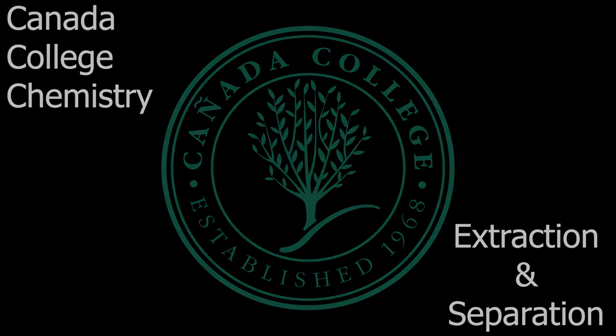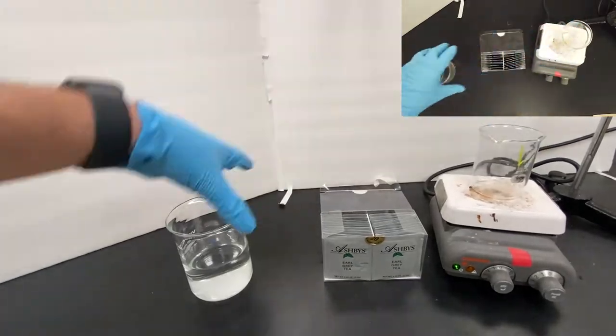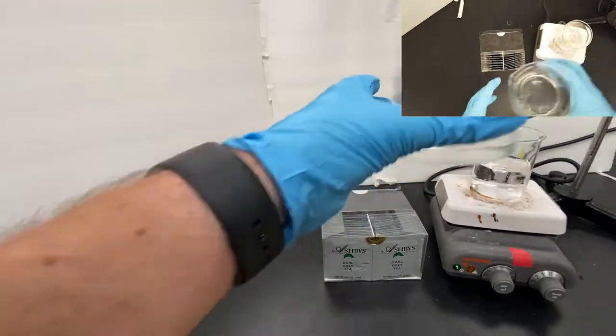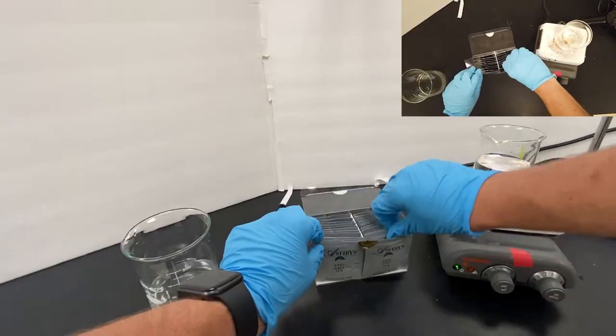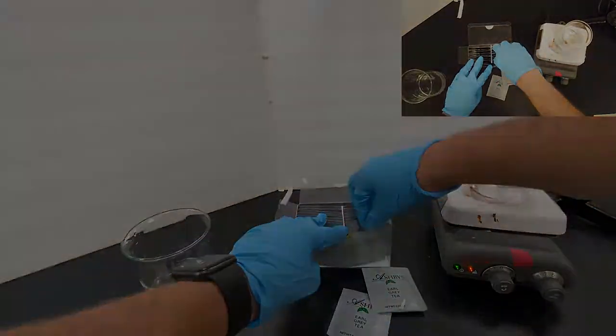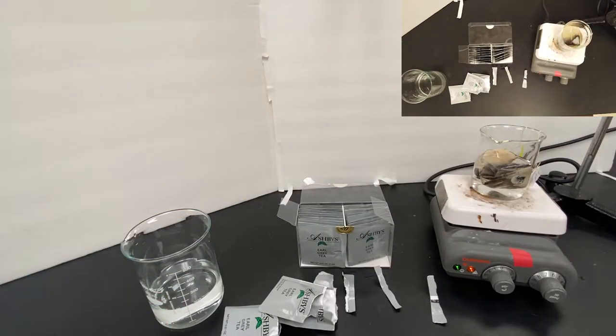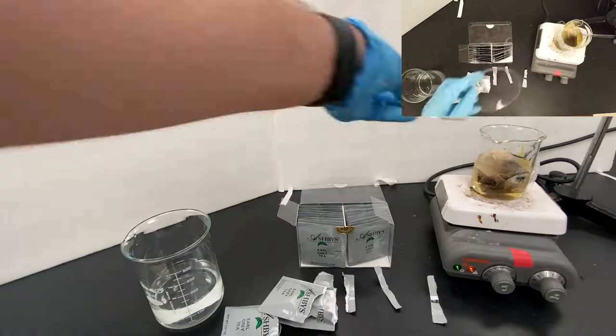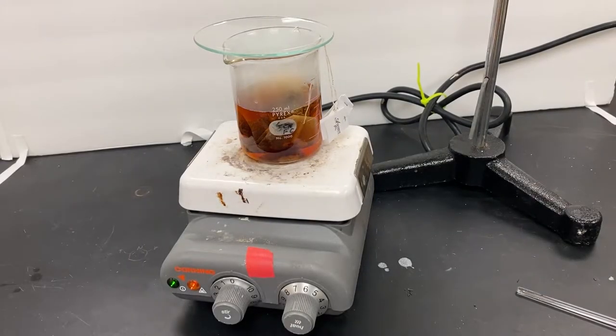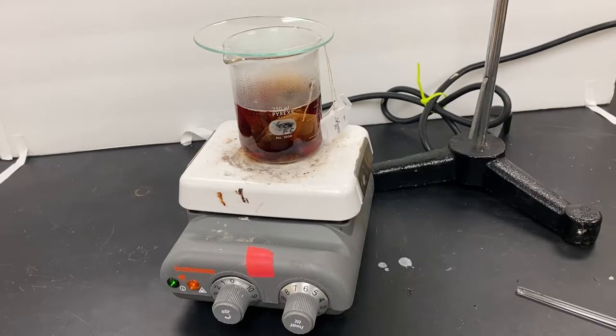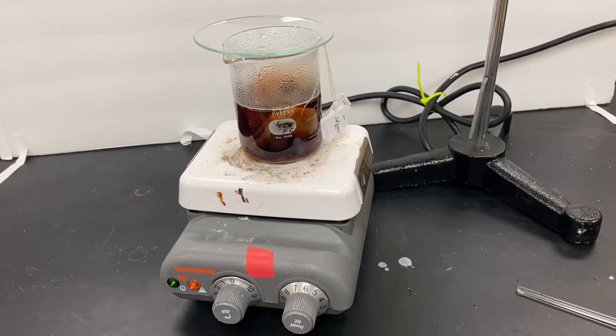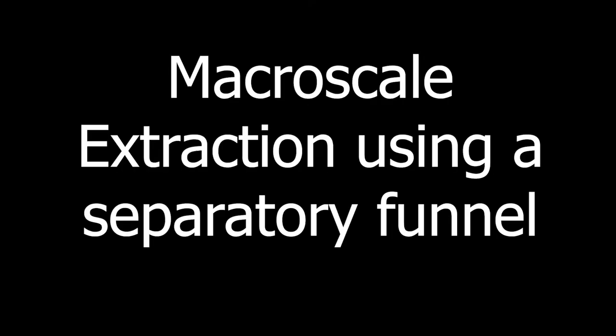Extraction and separation: how to extract caffeine from tea. First, place a 250 milliliter beaker on a hot plate and add about 150 milliliters of distilled water to the beaker. Open several tea bags and place them into the beaker. Place a watch glass over the beaker. This will help prevent the water from evaporating while it's heated to a boil. Remove from the hot plate once it has come to a boil and let cool.